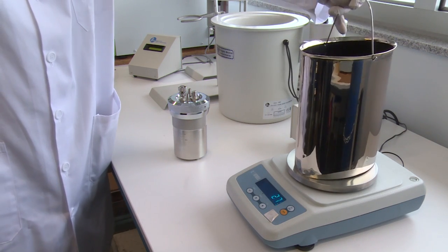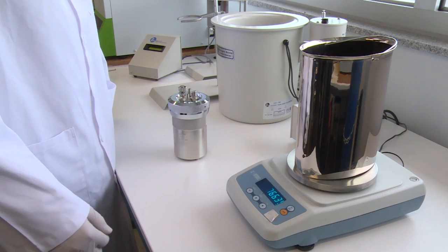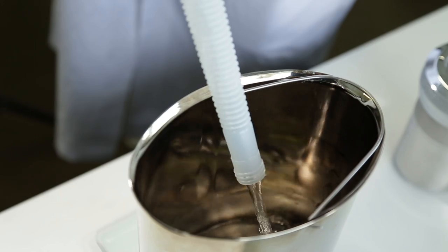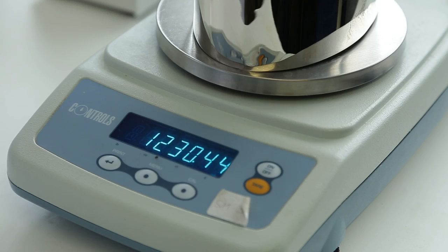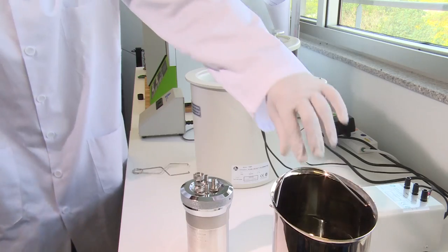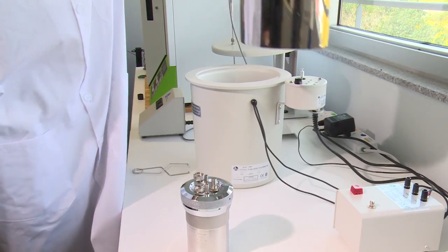Fill the calorimeter bucket by first taring the dry bucket on a solution or trip balance. Add 2,000 grams of water. Set the bucket in the calorimeter.